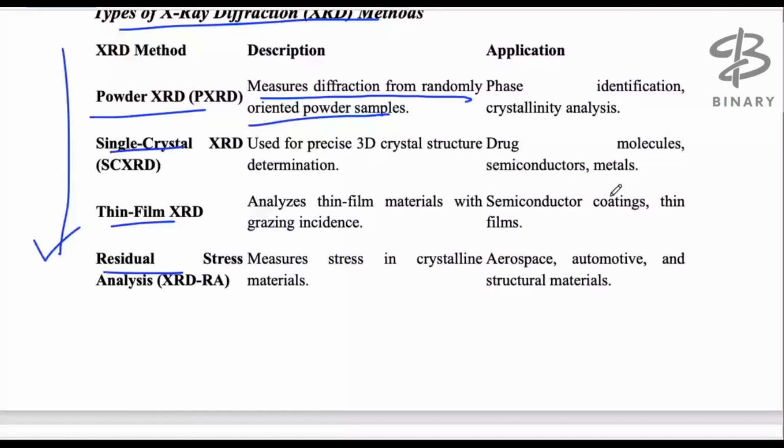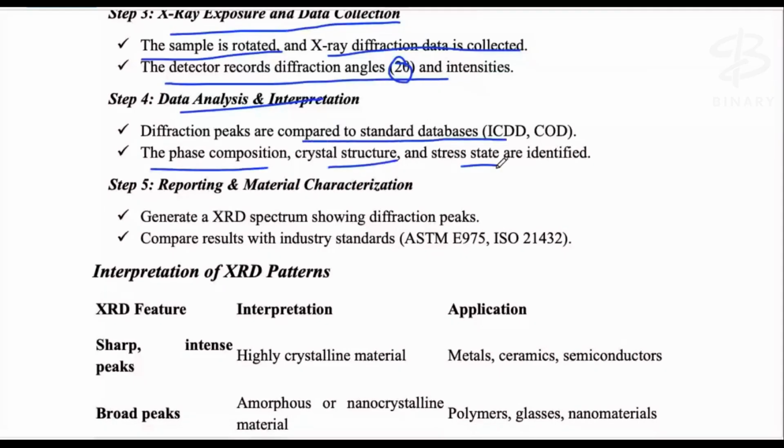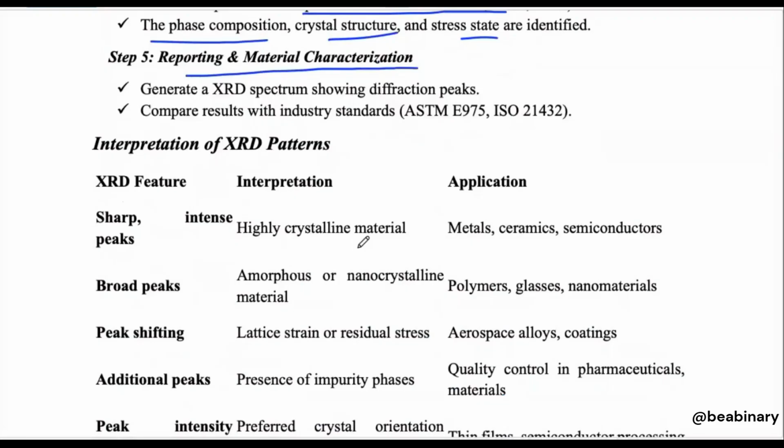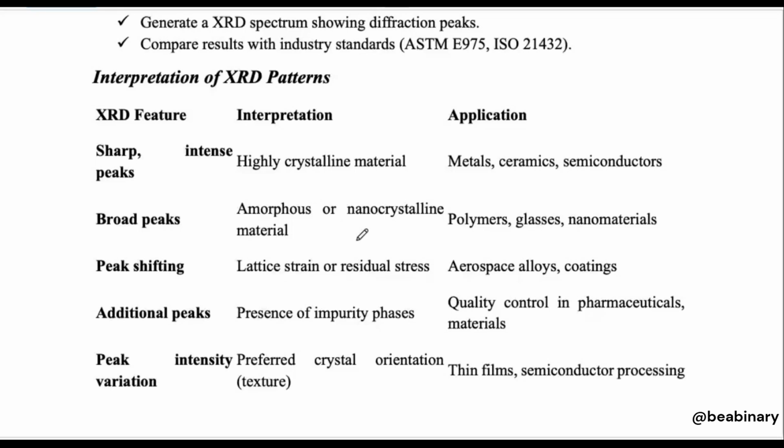Next, data analysis and interpretation. The different peaks are compared to the standard database. The phase composition, crystal structure and stress state are identified. Then report and material characterization, which is very simple. We compare with the industry standards. Here is the interpretation of XRD patterns.